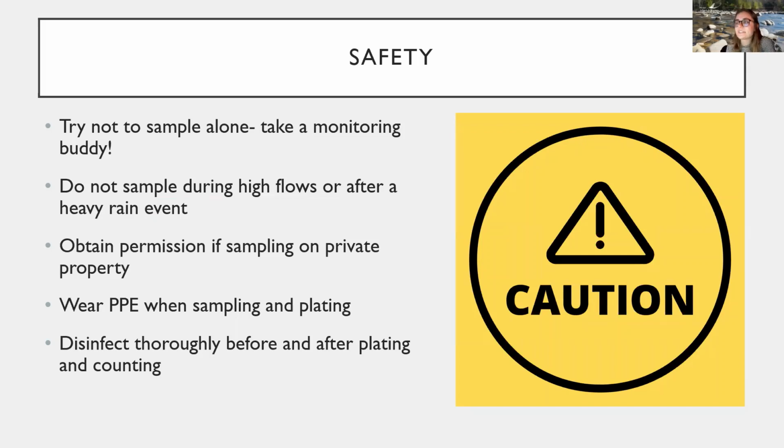Safety. Safety is incredibly important in all AdoptAStream monitoring programs, but there are especially some things in the bacterial monitoring that can cause potential harm. We've been talking about pathogens this whole time, right? And we've had people chiming in about wearing gloves and washing your hands. So making sure that's definitely part of your protocol is wearing that PPE, the proper protection equipment, when you're sampling, when you're plating, when you're collecting, all that good stuff. That's a pretty important part of this.